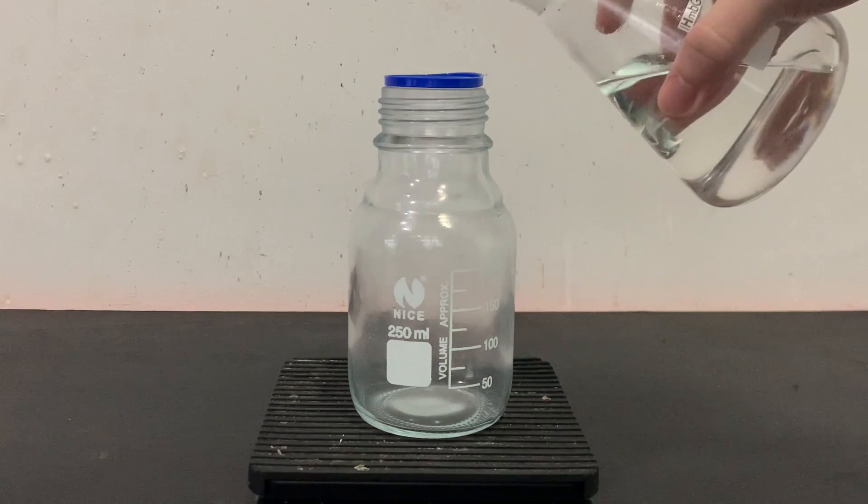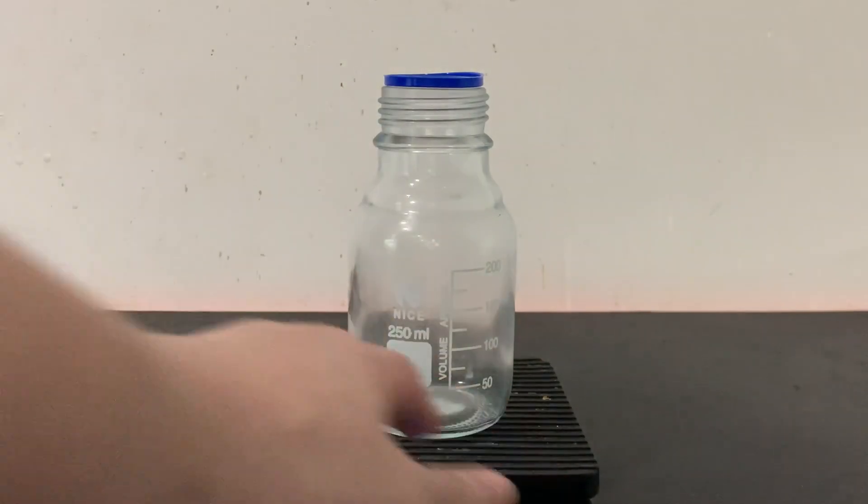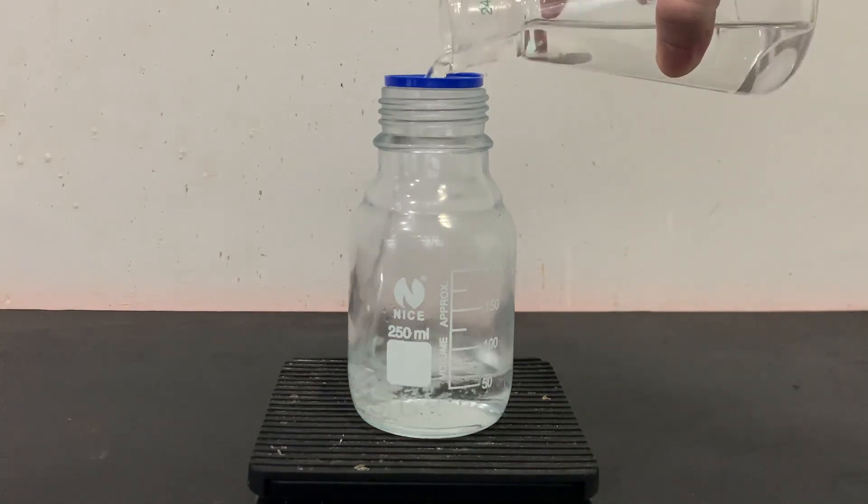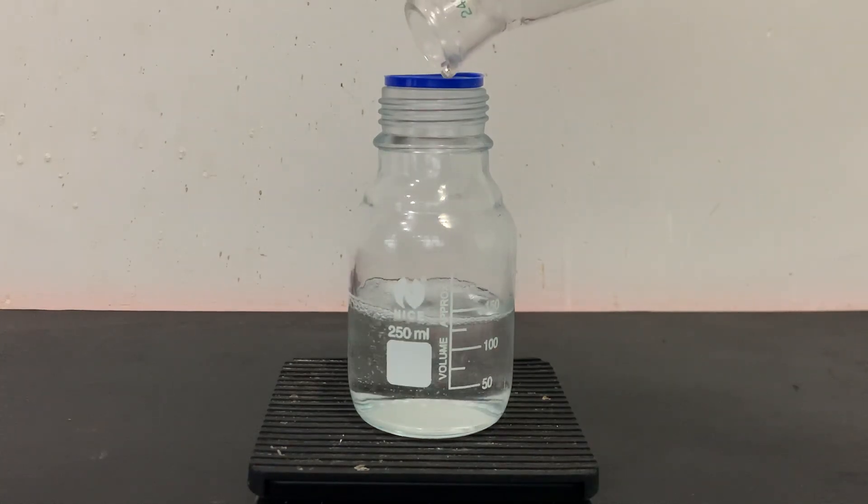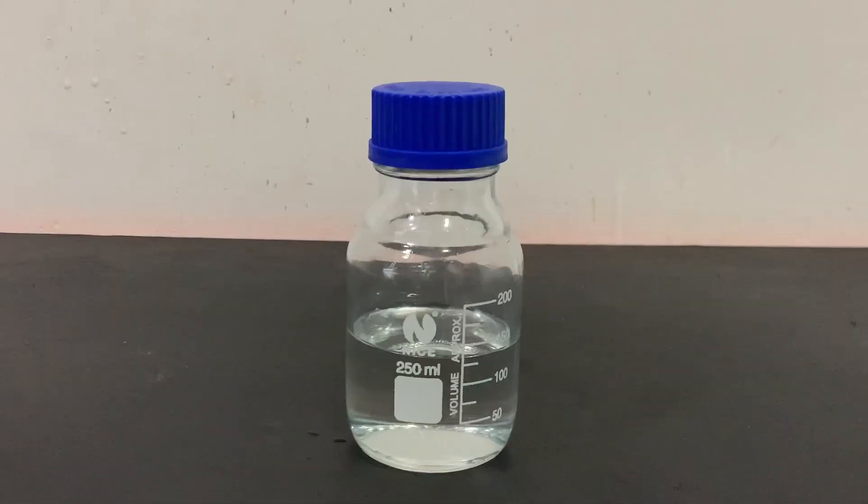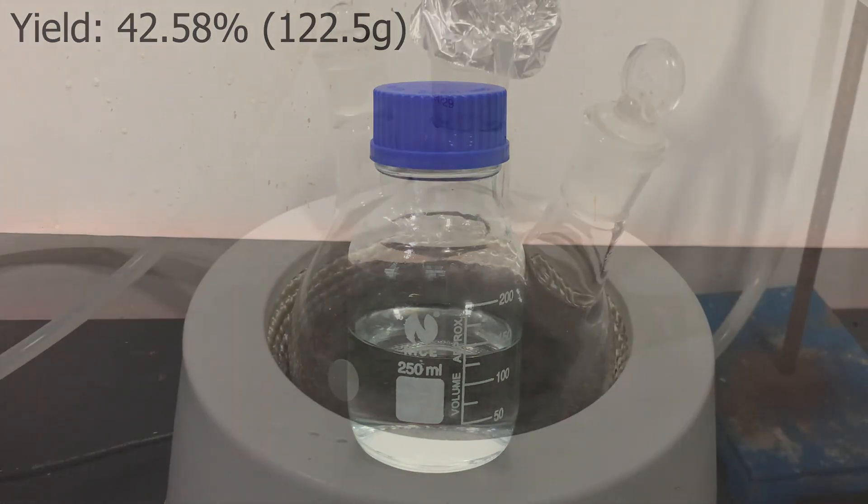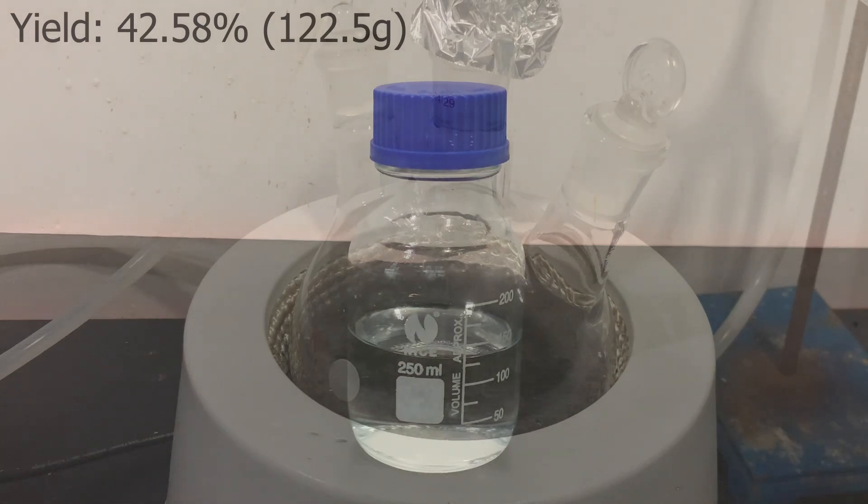The mass of the collected cyclopentanone was then measured. The yield came out to be lower than expected at 42.58 percent. From what I can think of, I stopped the dry distillation of the adipic acid too early which pretty significantly lowered the yield.